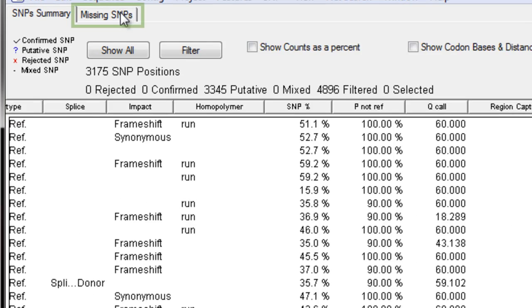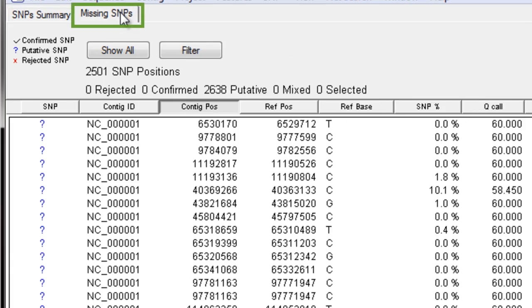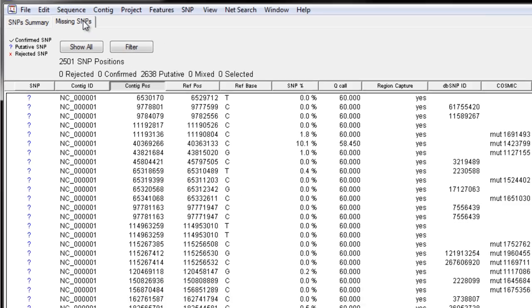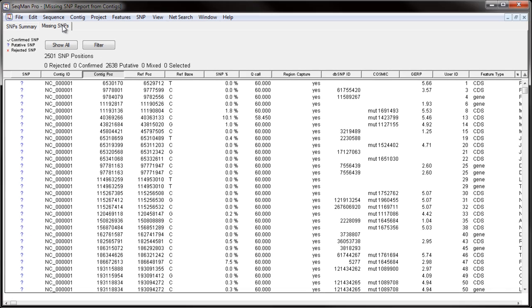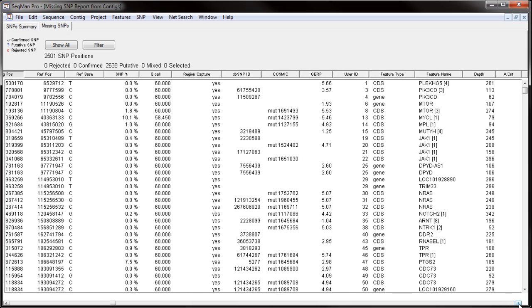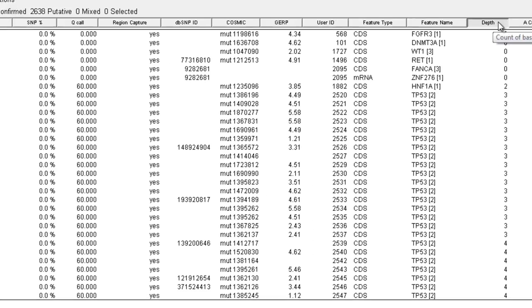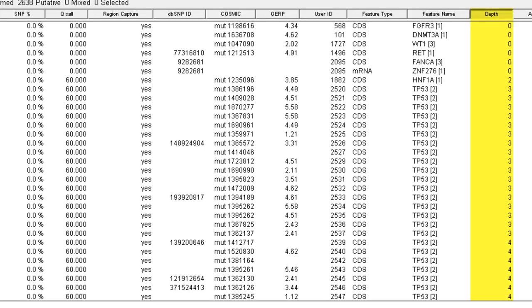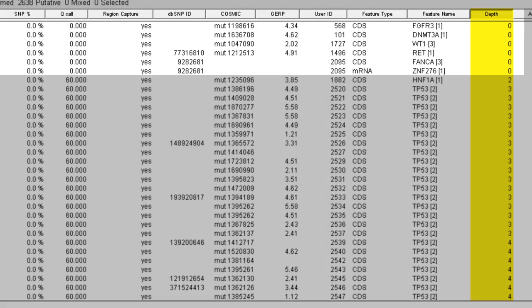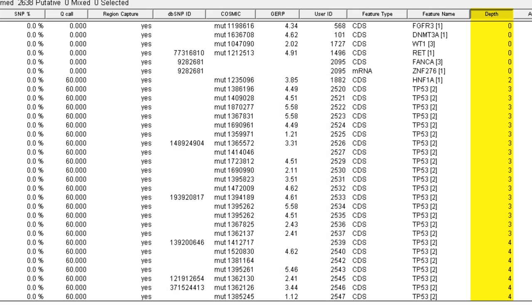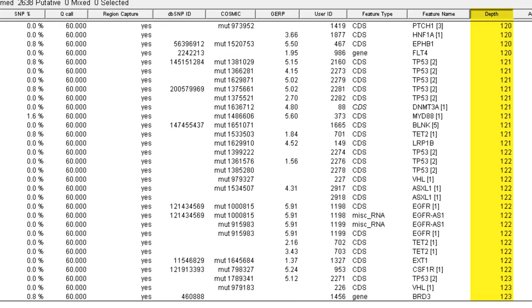If we go to the Missing SNPs tab, we can see SNPs that are included in the VCF file or in dbSNP, but were not found in our project. Here, we can sort the report by depth to help distinguish SNPs that are missing in areas of zero coverage versus SNPs that are missing in areas with coverage.